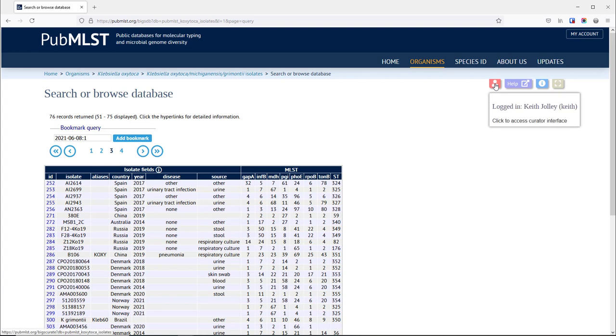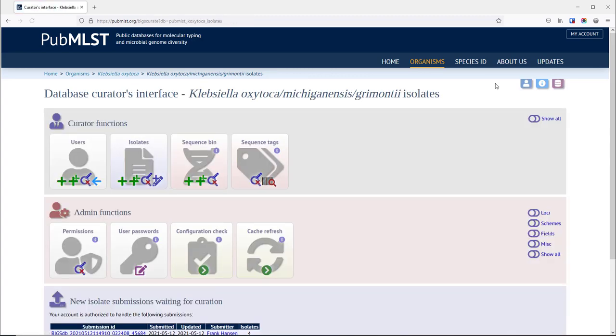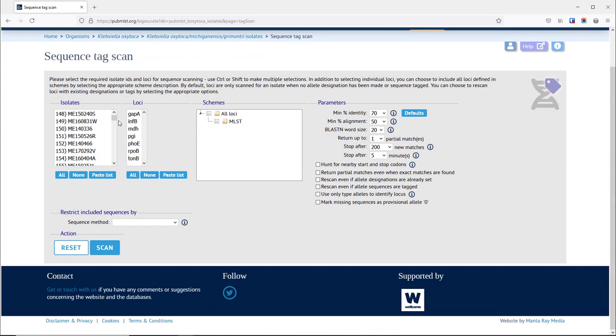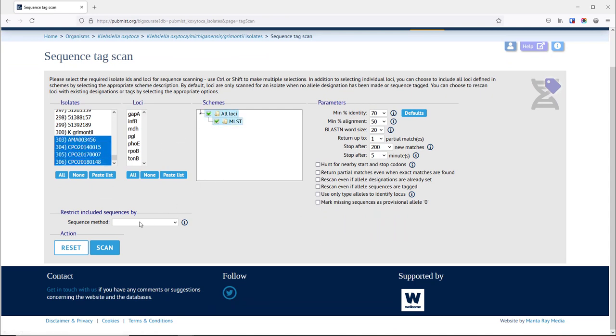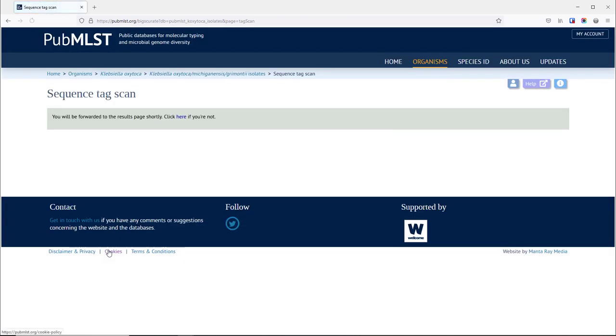If you're logged in as a curator then you can click on the curator icon at the top of the page and then go to the sequence tag scan page, select the isolates that you want to scan and the loci, so in this case all the MLST loci, and then click scan.